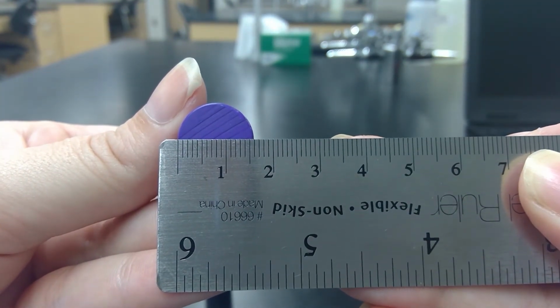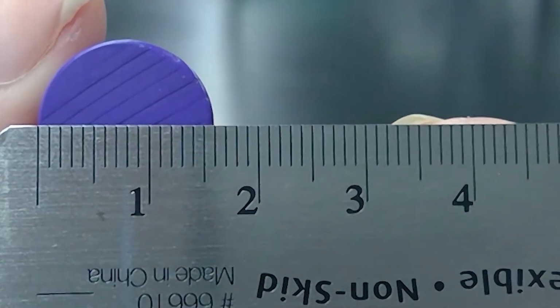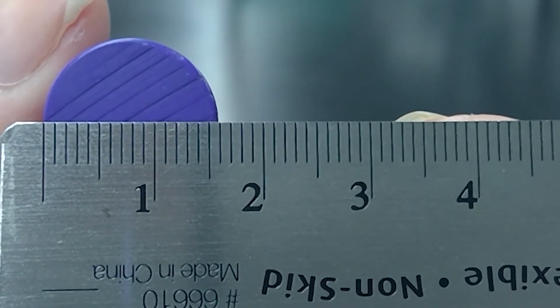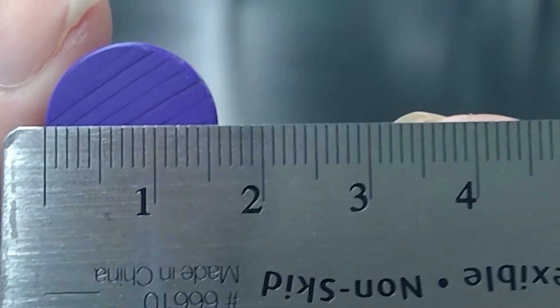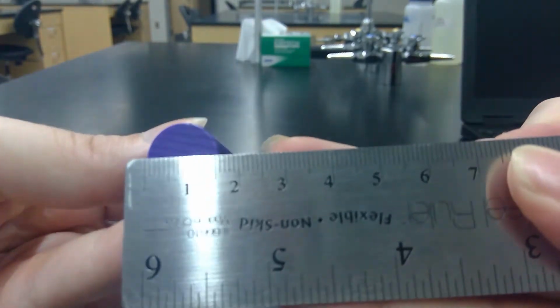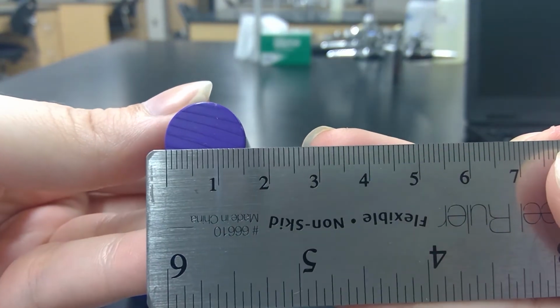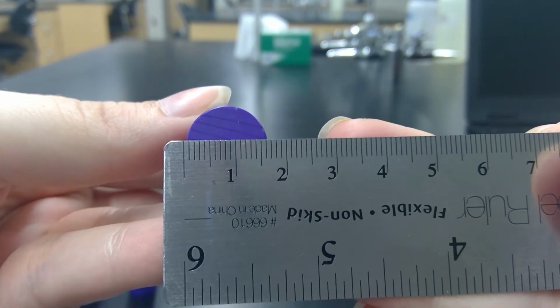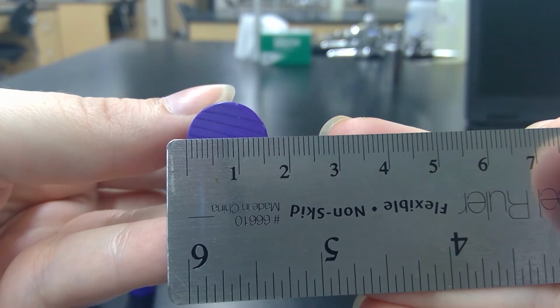Record the diameter. And wait for it to focus. Record the diameter.